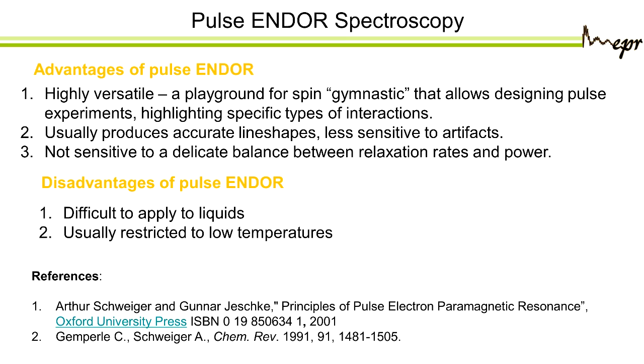And also, it is not so sensitive to all these. You remember we talked about having the right relaxation pathway not to get bottlenecks, so you don't have to worry about looking at the temperature that will fit. You know that if you go to low temperature, the lower the better, and that's it. Now, the line shapes that you get are usually more accurate, and they don't have artifacts.